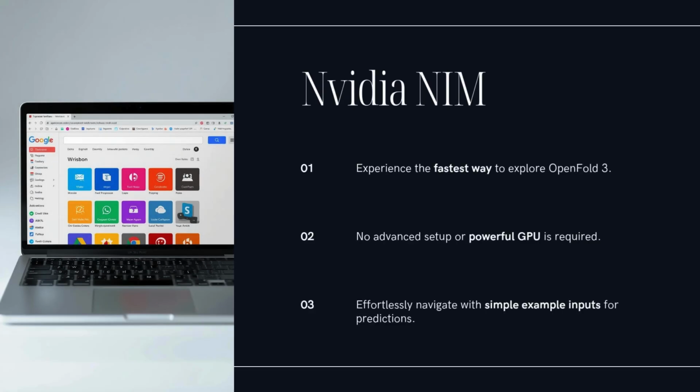That's a massive advantage, especially combined with the open license. Okay, that's powerful, but fine-tuning sounds advanced. If I'm just starting, I want the easiest path. Which brings us to how to run a prediction.